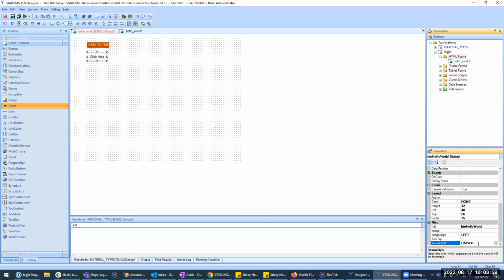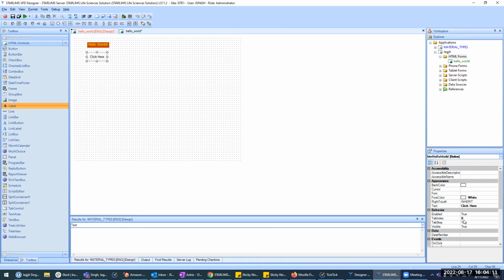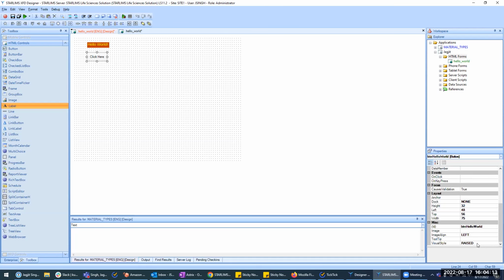The idea being raised is going to make that button blue, and it's going to call attention to that button as an action that somebody should be doing, versus white, which is more in the background, right? So think of an add in blue and then a delete in white. That's usually the best scenario. Anyways, so raised, we can see that in blue.